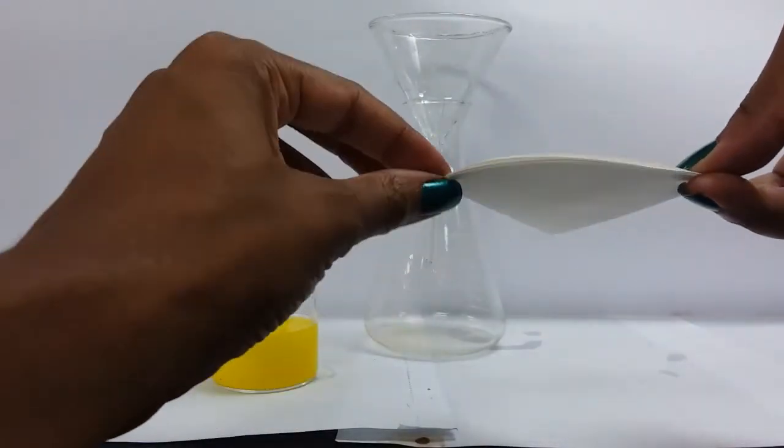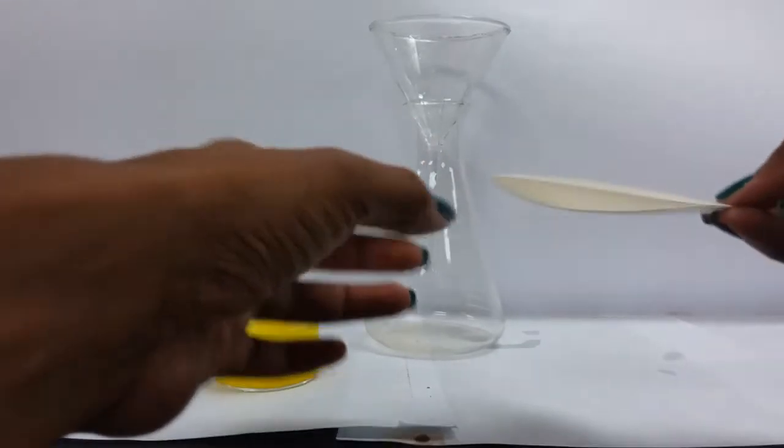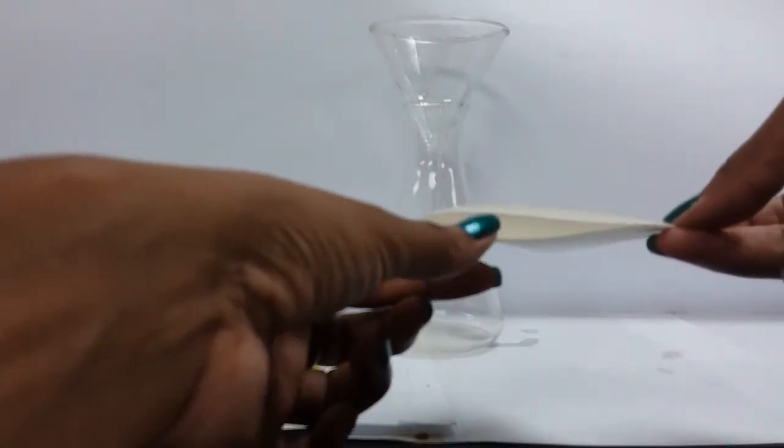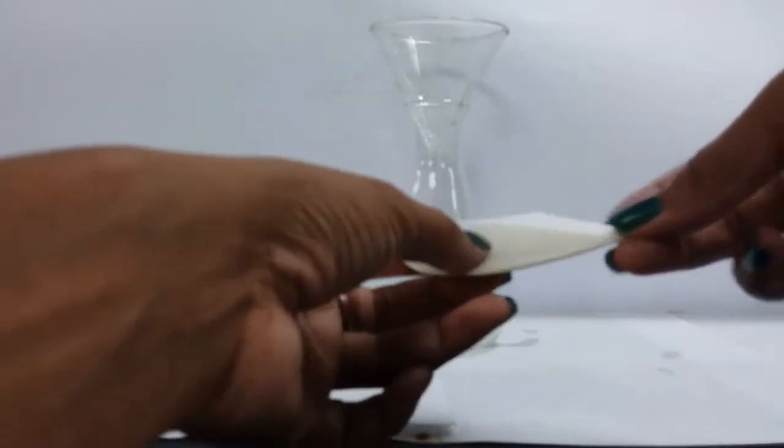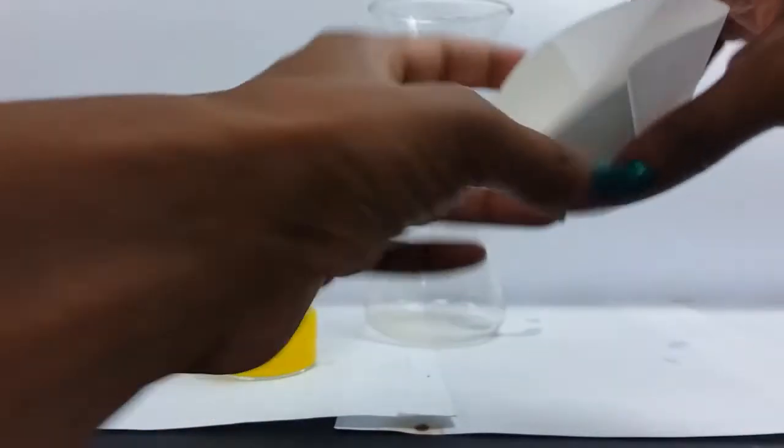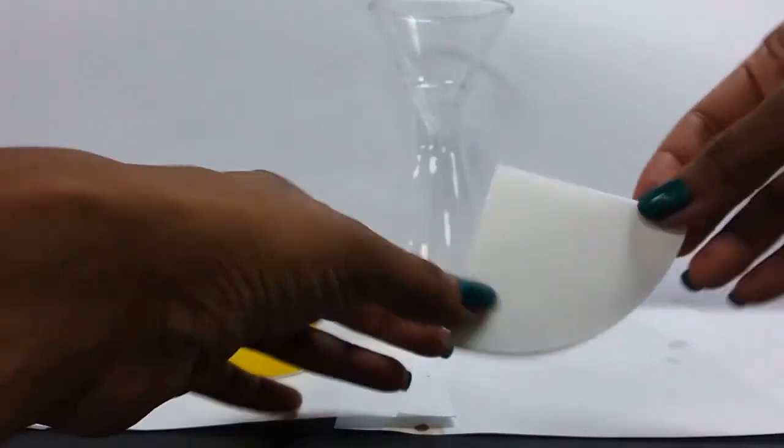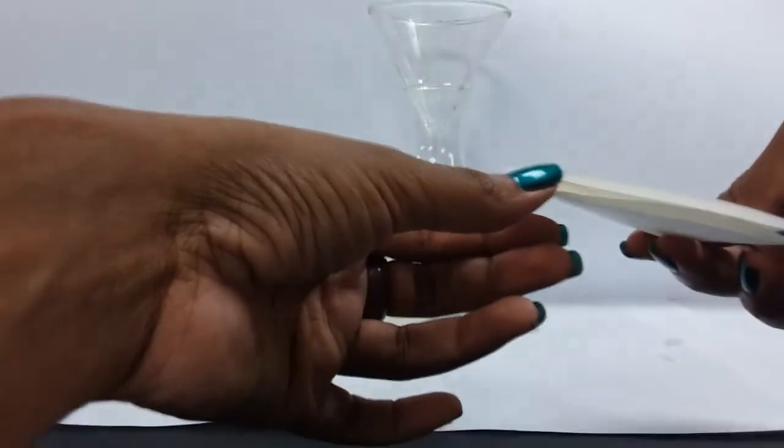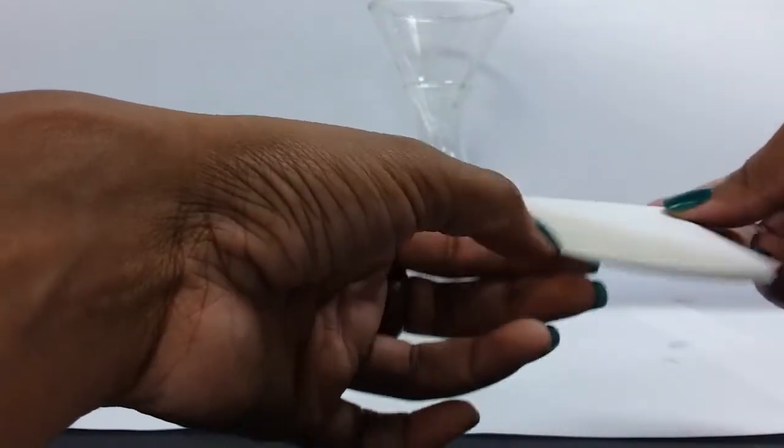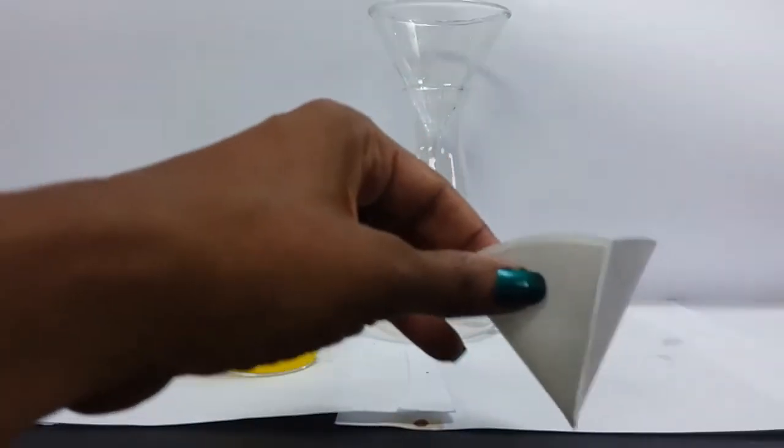So we have our folded filter paper, and you will take your finger and place it into one of the pockets, if you will, and open the filter paper to create a cone. I'll do that again. We have our filter paper folded into quarters, and we're taking our finger and just placing it into one of the pockets, and opening it into a cone. So we're going to place our filter paper in our filter funnel.